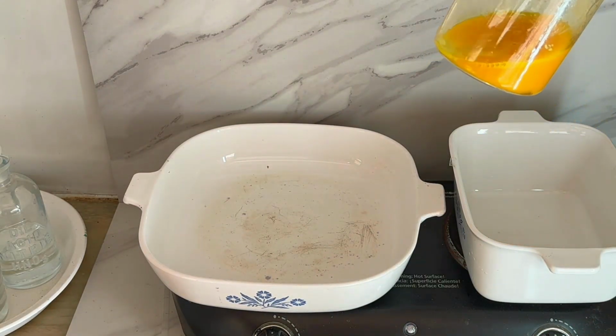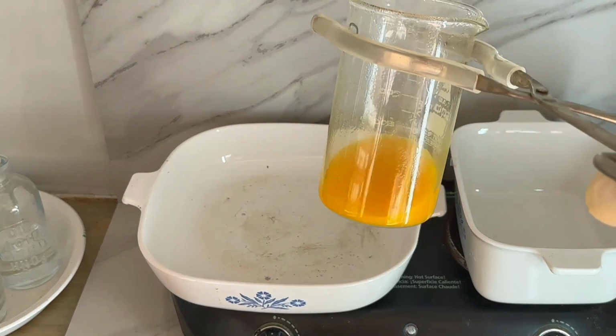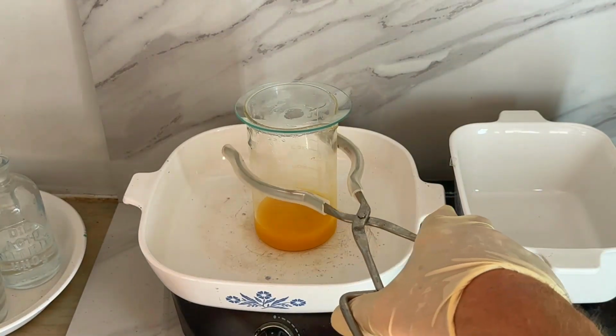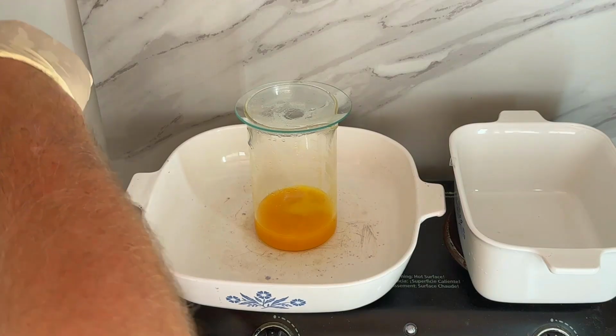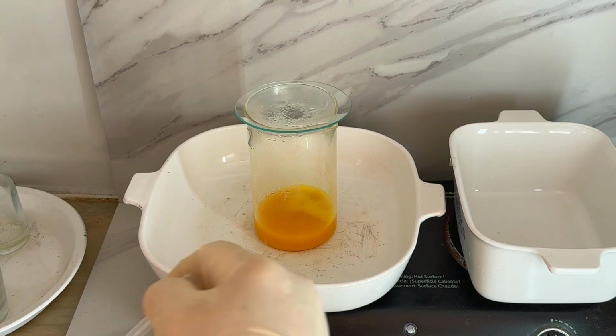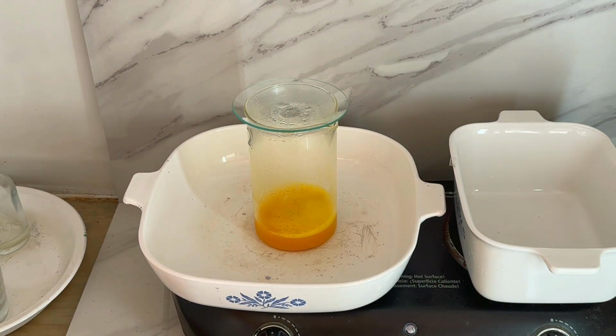So I pulled it off the heat just to let the bubbles stop enough for me to see if there's solids still left in here. It's hard to tell on the camera from this angle, but there are some solids in there. So I'm going to put it back on the heat and give it a little more nitric acid. See, when I do that, the reaction picks up considerably. Let that go for a while, checking occasionally to see if there's any solids left in there.